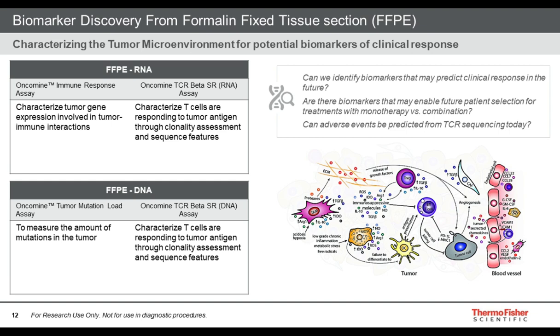Another advantage of using RNA as input is that at analysis time, we can make the assumption that the reads are coming from full-length productive RNA sequences. So in other words, mathematically, we can assume that the length of all of the sequences should be a multiple of 3. And that allows us to perform some informatics-based error corrections to achieve extremely high accuracies when using RNA as input. In situations where the RNA from FFPE is too degraded, DNA may end up being more effective. So it's something that people may wish to consider, possibly try both approaches and see which one works best.